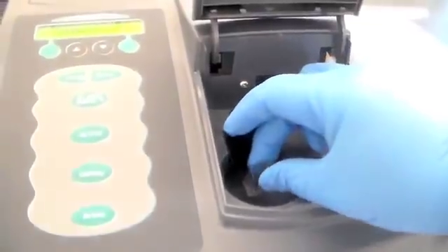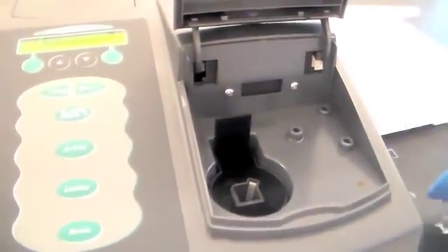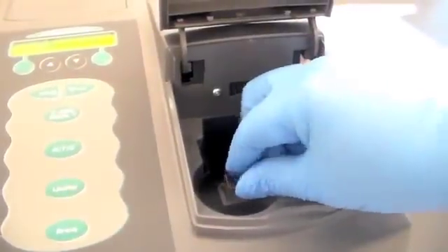You'll do this before you put in your sample. As soon as you get a reading that says at 600 nanometers you have a 0.000 absorbance, A stands for absorbance, you know the machine is blanked. So you can now take that blank out and insert your culture. Close that up. You don't have to hit anything else. It will automatically read the absorbance. This is my time zero, so I didn't expect very much absorbance, and I don't have very much absorbance, 0.002.